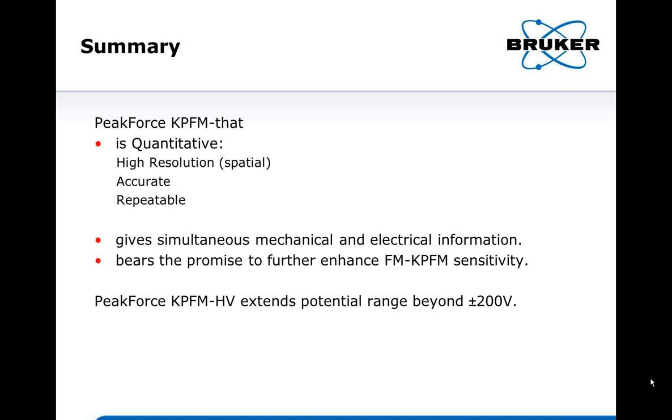In your example of AM versus FM mode on the lead-tin alloy with microphases, the person is asking, it seemed the topography was disturbing the AM but not the FM detection. Why would that be the case, or what was going on? We did see a little artifact on the AM mode, and honestly, I'm not quite sure why that happens.